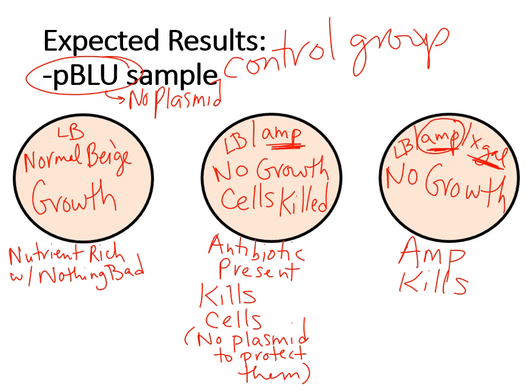When you're troubleshooting, ask yourself, what might be wrong with the bacteria? What might be wrong with the plate, okay? What would lead to growth in these presents? Now, the way to troubleshoot this kind of thing is you can think of each step in the protocol and where things can go wrong. Also, you can ask yourself, well, if I have ampicillin on a plate and I have no plasmid present according to my labels, what might cause growth on an ampicillin plate?